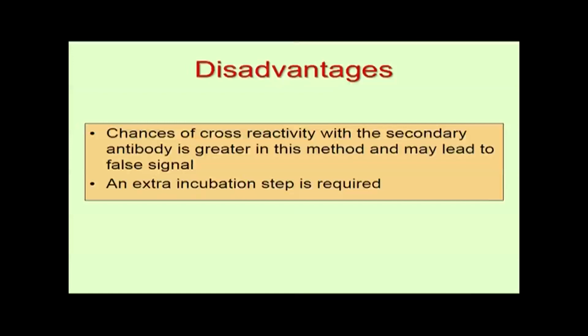What are the disadvantages of indirect ELISA? Since we are using two antibodies, the chances of cross-reactivity increase in this technique, and since the technique uses more than one antibody, obviously it will take more time. So, an extra incubation step is required here.